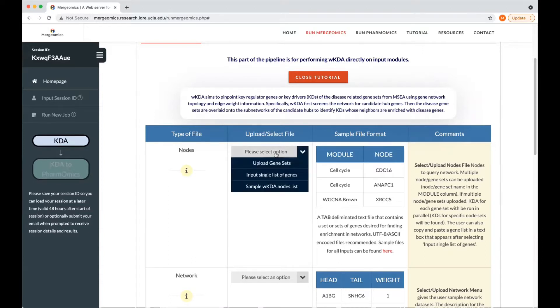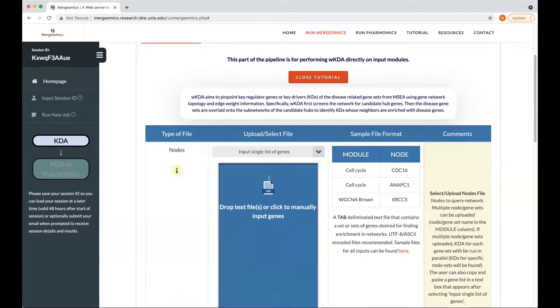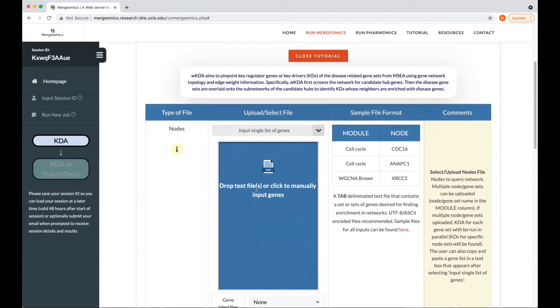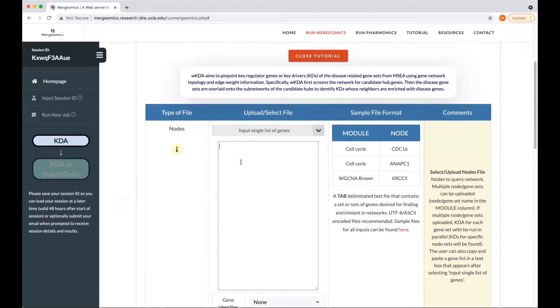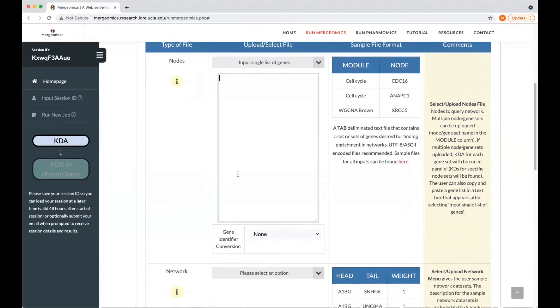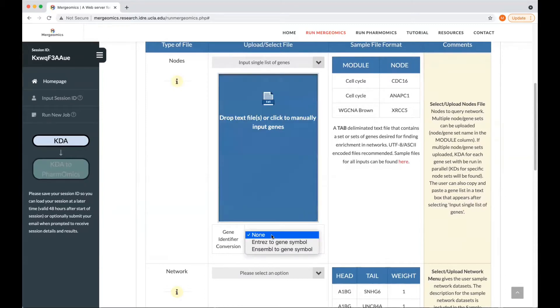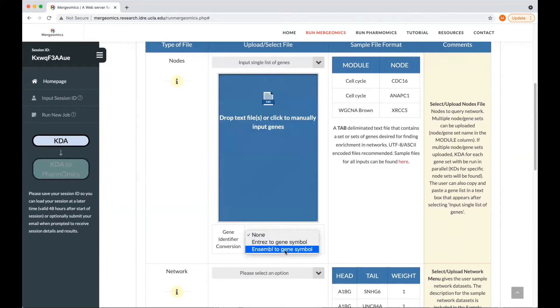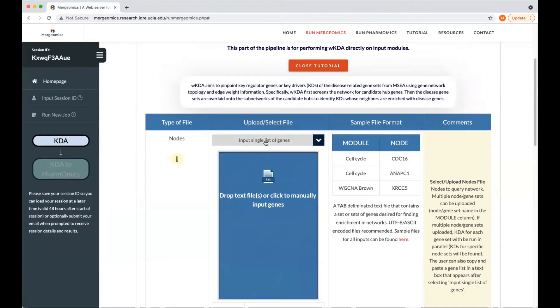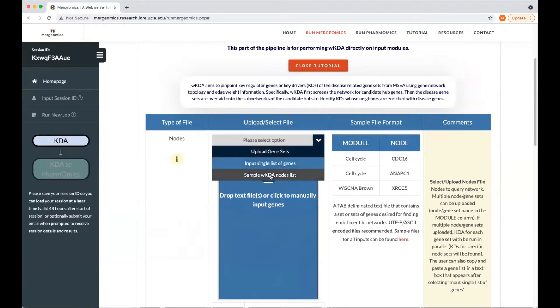Additionally, we provide the opportunity to upload a single list of genes, which can be in the format of a txt file where you can drag and drop your txt file into this box, or you can manually input your genes. For convenience, we also provide a gene identifier conversion, where we can convert Entrez IDs to gene symbols, as well as Ensembl IDs to gene symbols. In this example, we would just select the sample input list.